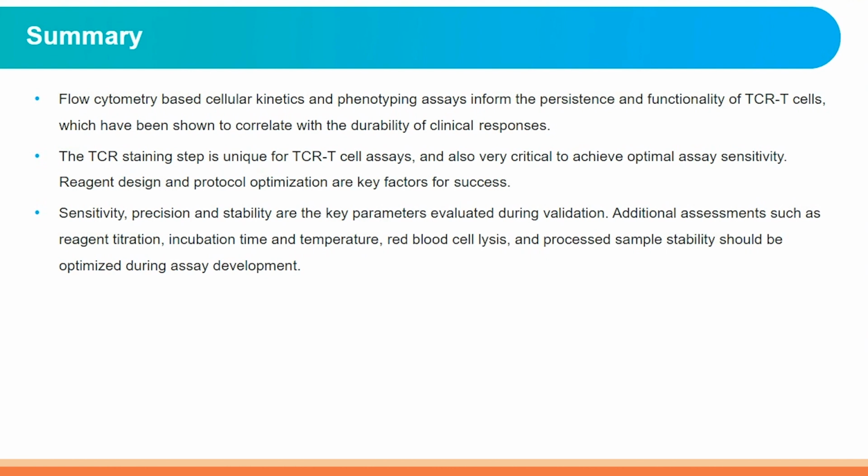Sensitivity, precision, and stability are key parameters evaluated during validation. Additional assessments such as reagent titration, incubation time and temperature, red blood cell lysis, and processed sample stability should be optimized during assay development.